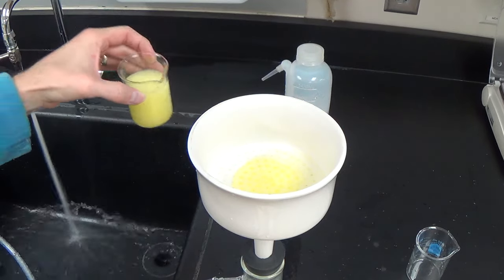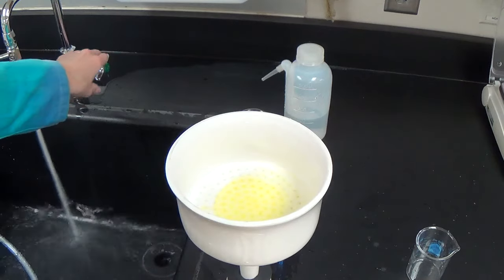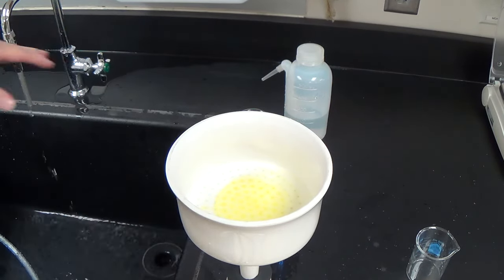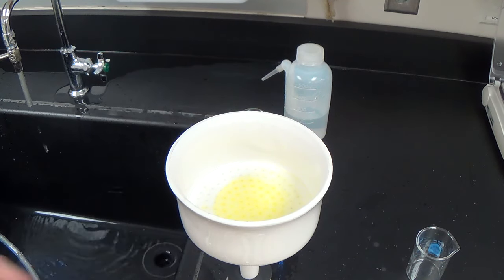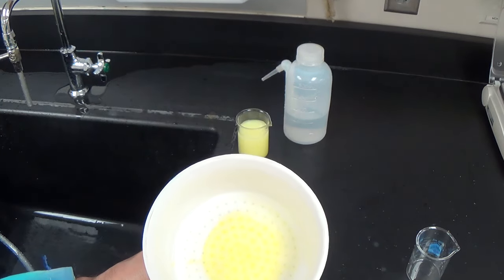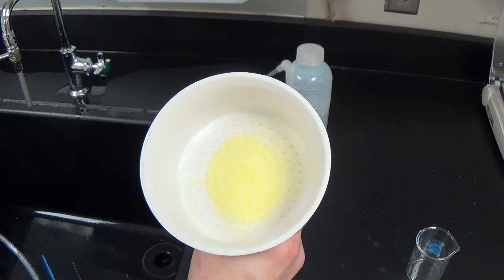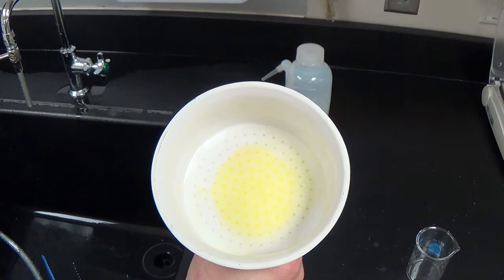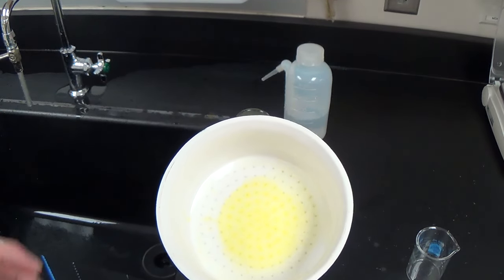Okay, so pretend that I have finished filtering all of that. What would I do? Well, I would obviously turn off the water, and I would clean out the flask before putting it away. What do I have in the funnel? I have my wet filter paper with the precipitate on it. And again, your precipitate is going to be white. You might not actually see the precipitate, but it will be there. All right.